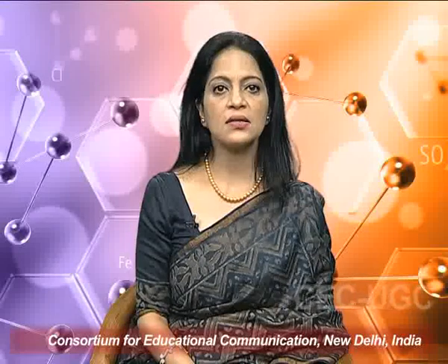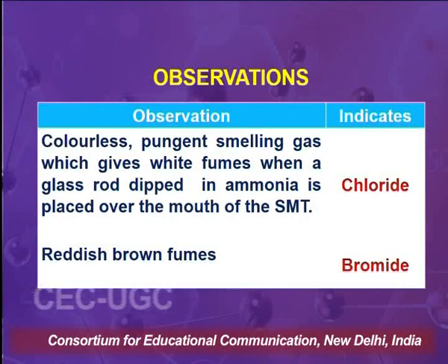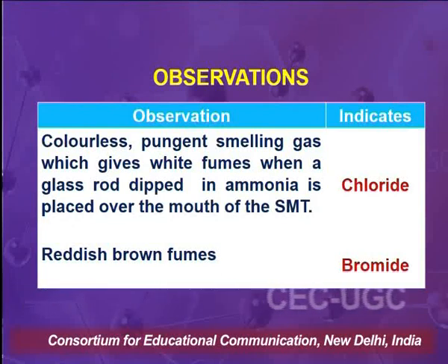In case there is a colorless, pungent smelling, toxic gas which gives white fumes when a glass rod dipped in ammonia is placed over the mouth of the semi-micro test tube, it indicates the presence of chloride ions in the mixture. Those colorless pungent smelling gases coming out are due to HCl, which on coming in contact with ammonia forms ammonium chloride, giving white fumes or a white deposit on the glass rod.